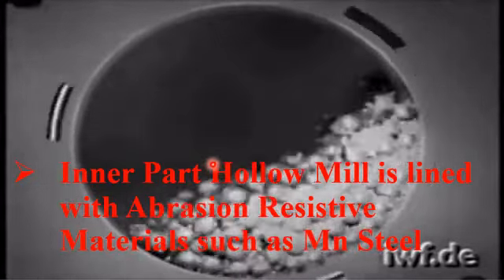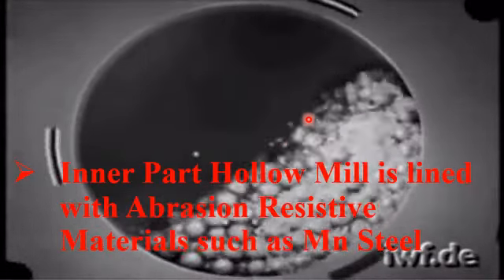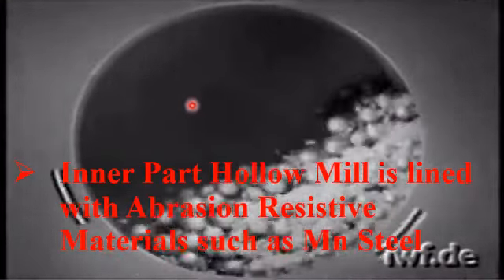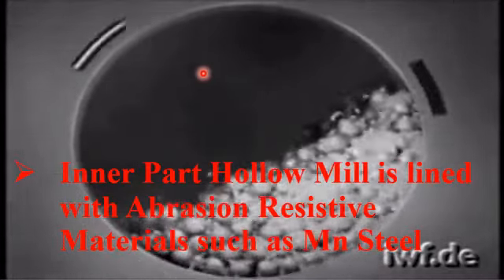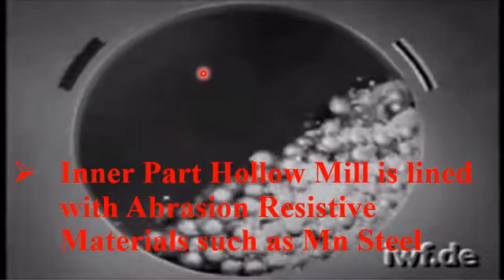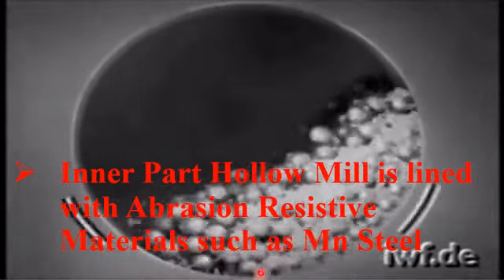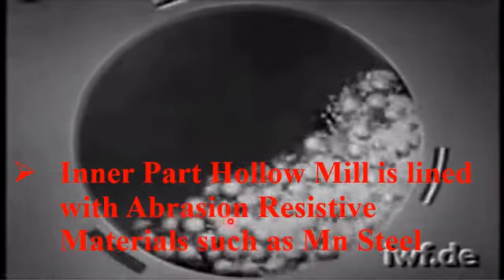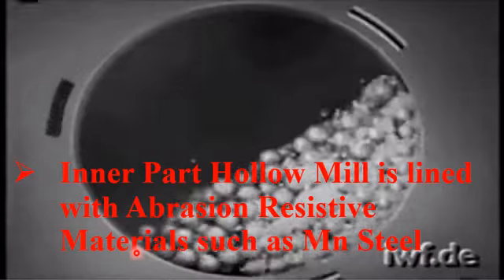So they will result in impurity. The powder which is prepared will have impure material from the surface of the drum. Due to this, we will never get pure nanopowders. So in this case, the ball milling machine uses abrasion resistive materials. They are friction free materials.